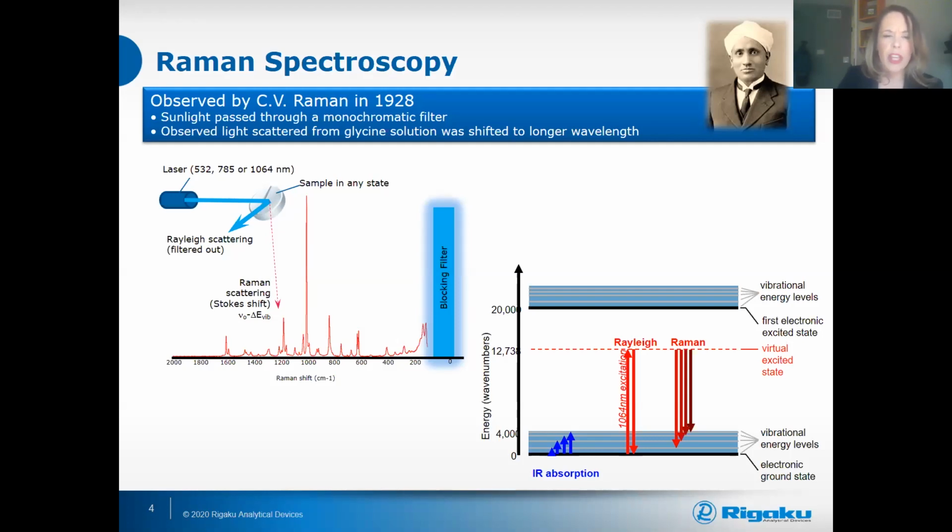Specifically, when we're looking at Raman scattering, and if you look here on the left side of my screen, you'll see that instead of white light, we point a single wavelength of light, a laser. In the case of Progeny, it's a 1064 nanometer laser at the sample. And then what we see is Raman scattering of that single wavelength of light. And we measure the Raman scattering that happens as a fingerprint that's specific to that molecule or element. And when we can do that, we get a very, very unique advantage through Raman spectroscopy to give an idea of what that material or element is.